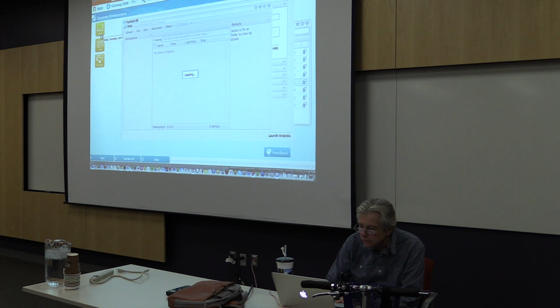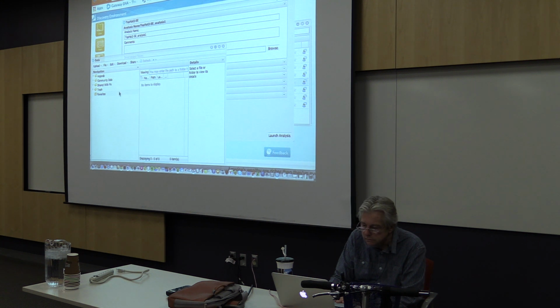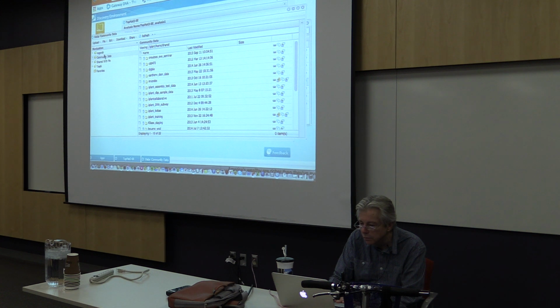And hopefully not to take too much time on this, because it's probably not real exciting to watch me point and click at things, but if you've never done this specifically, and also to make it clear, the information that we'll be working with, the files that we're starting with today, and the result files that we'll be cheating with, that is looking at the answers before we actually have them, are here under iPlant training, under community data. So if you look in your data window, that's where you go to look at the data that's available to you.